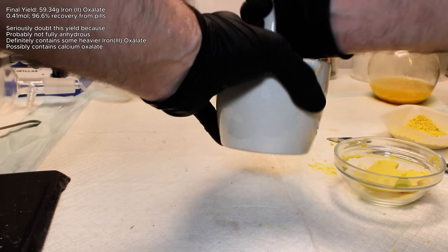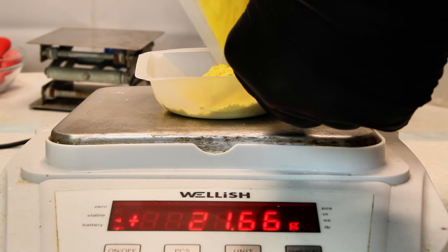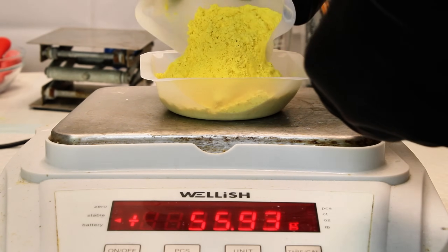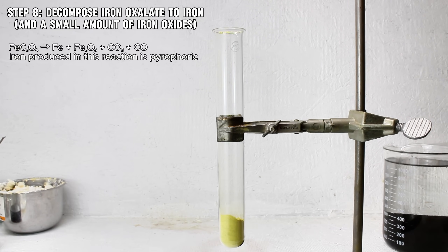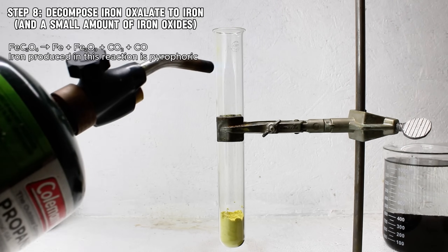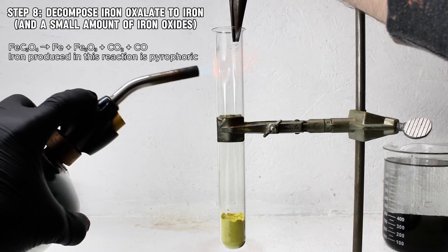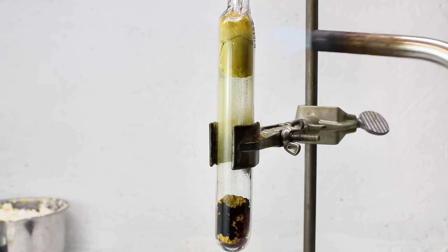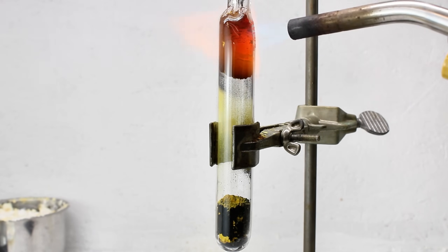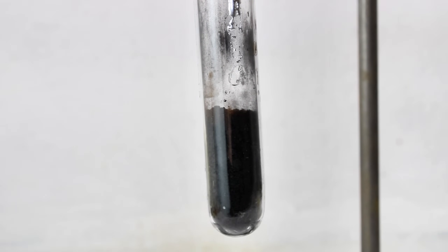Now to convert the iron oxalate to iron, I simply needed to strongly heat it. The only problem with this is that the iron formed this way is referred to as pyrophoric. This means that the iron that results from this reaction will aggressively react with any oxygen present to form iron oxide. To prevent this, my idea was to heat the iron oxalate in a test tube. Ideally, the carbon dioxide produced by this reaction would displace any oxygen present in the tube, giving me just enough time to turn the tube into an ampoule, sealing out any oxygen and saving my pure and highly reactive iron. However, it turned out that this tube was way too large to easily turn into an ampoule, and once it began to crack, I decided to simply crimp the top once the reaction was complete in order to give the iron enough time to at least appear on camera.